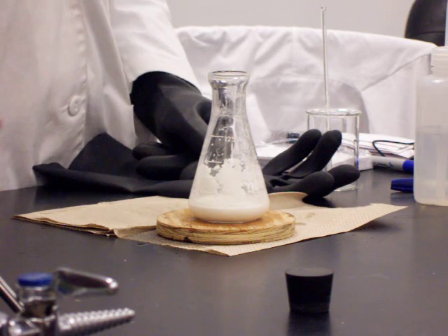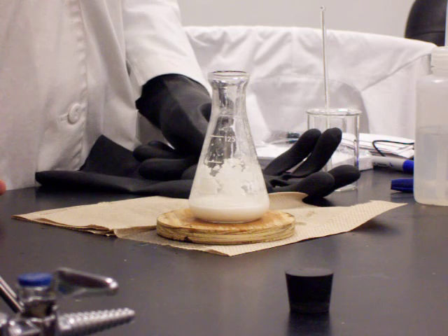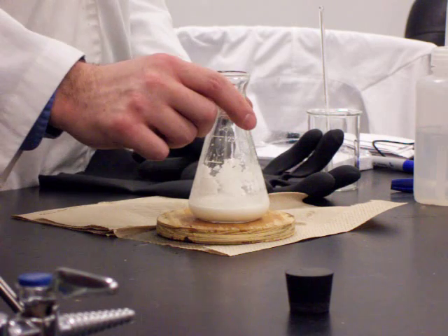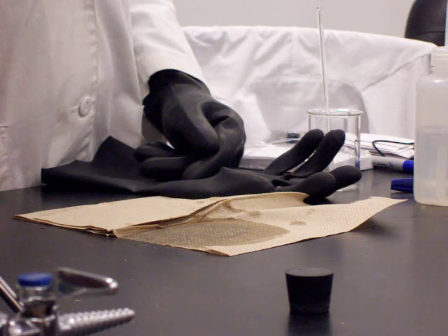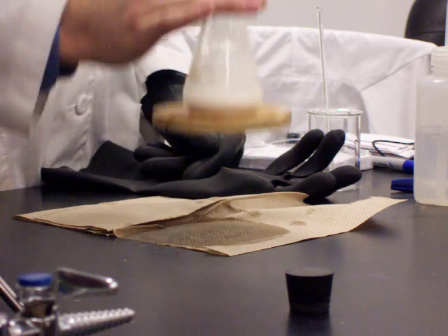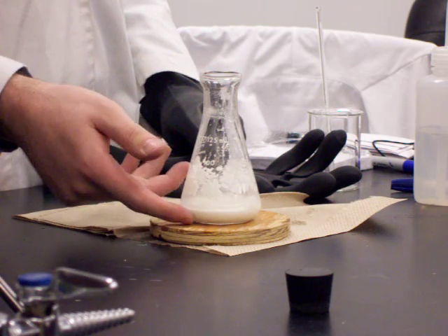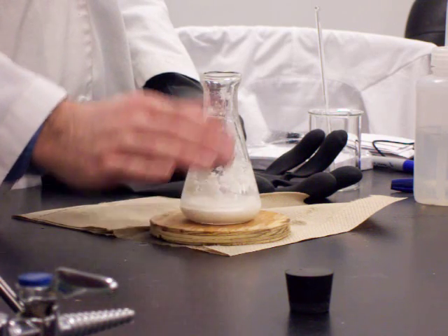I can smell it here — I don't expect you to be able to smell it at this point. The smell smells like ammonia. The water I squirted onto the top of the wood disc has frozen in between the flask and the wood there.